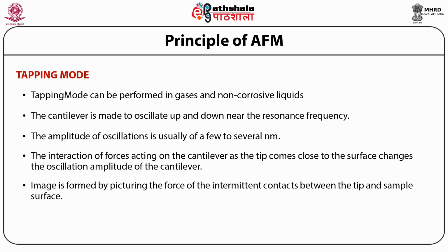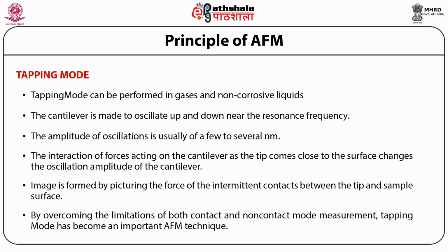By overcoming the limitations of both contact and non-contact mode measurement, tapping mode has become an important AFM technique. The lateral forces which damage the sample, thereby reducing the image resolution, are not applied. Thus, the tapping mode can be used for routine analysis of sample surfaces, which was earlier considered impossible with atomic force microscopy.